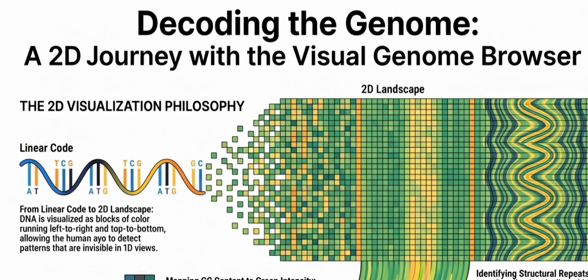You are checking for an open reading frame, or an ORF. Okay, can we break that down? What exactly is an open reading frame in this context? Well, the cellular machinery that reads DNA and builds proteins, the ribosomes, they don't just start building randomly. They look for specific start signals, kind of like a capital letter at the beginning of a sentence. And they stop building when they hit a stop signal, like a period.